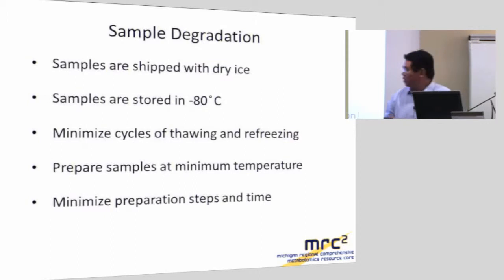So please pay attention to your sample environment and conditions, because your sample conditions really determine how sample preparation goes and how your final results will be. So please ship your sample in dry ice. That's the best way. And we will store your sample at -80 immediately.